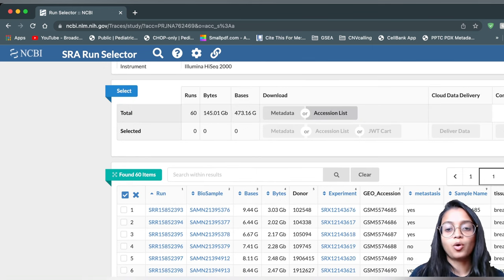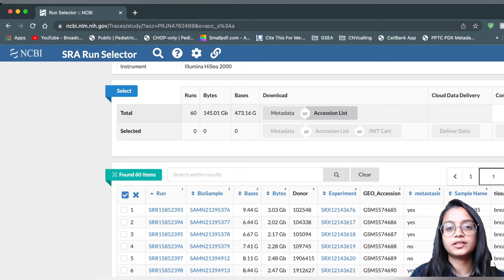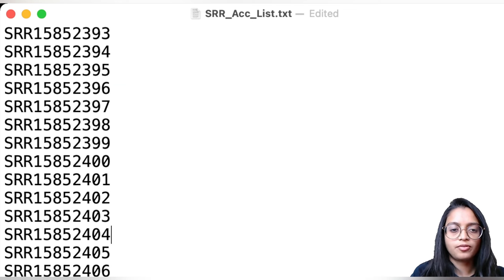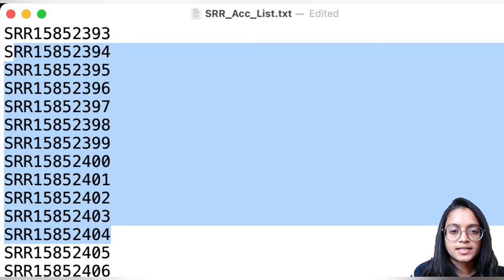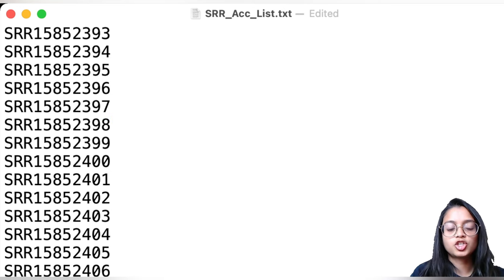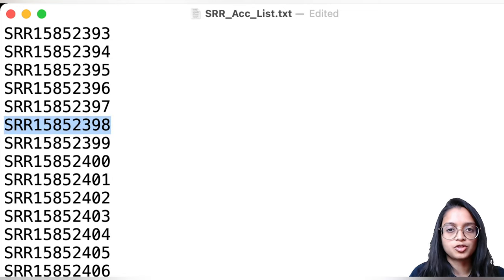So technically, each run will have sequencing data associated with that sample. If you want to download sequencing data for all the samples in this cohort, you can click on the Accession List button under the download section. It will open a dialog box allowing you to save a text file containing all the SRR IDs to your local system. Once downloaded, you'll have a text file with all the SRR IDs associated with your samples, which we'll use to fetch the sequencing data.